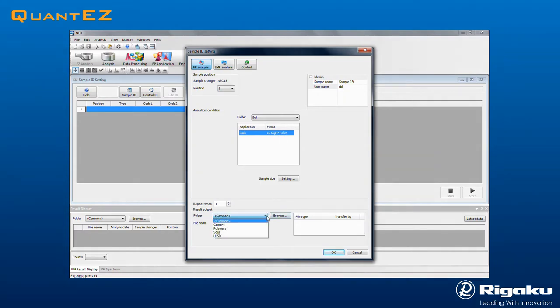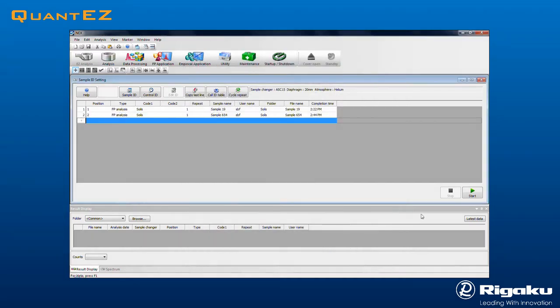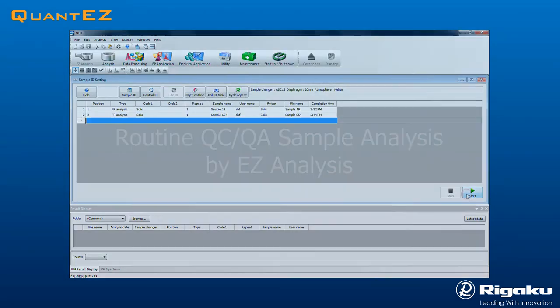Then select the Results output folder. Click OK to complete. Additional samples may likewise be added. Click Start to begin data collection.